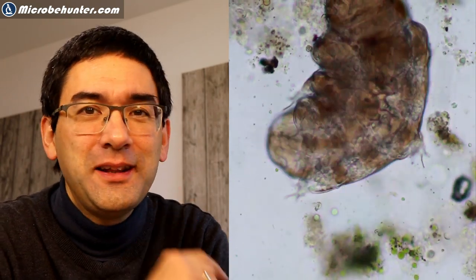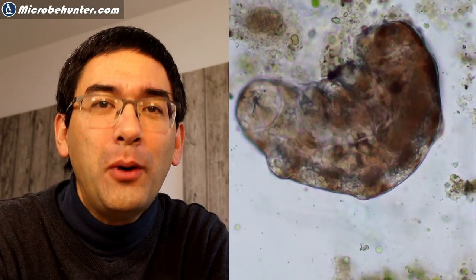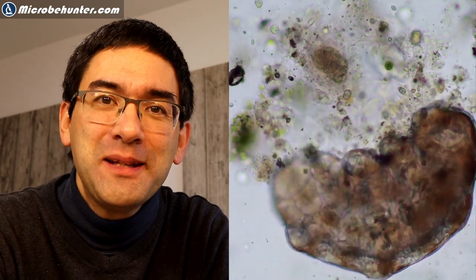Hi, Microp Hunter here. Look at this — this is a tardigrade, also known as a water bear or moss piglet, and I'm really happy that I found one of them in my specimens. I'm going to show you how I've done that and we're going to have a closer look at how this tardigrade moves around on my microscope slide.